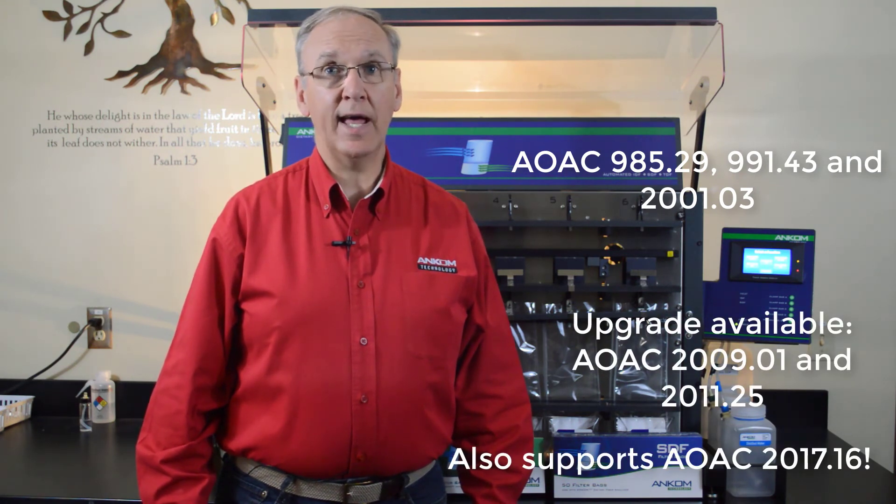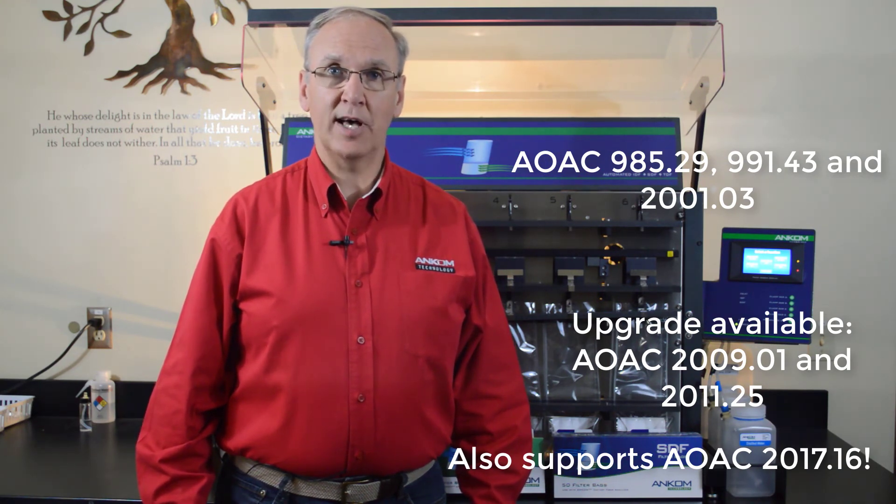991.43, and 2001.03. An upgrade is available that will add AOAC 2009.01 and 2011.25.